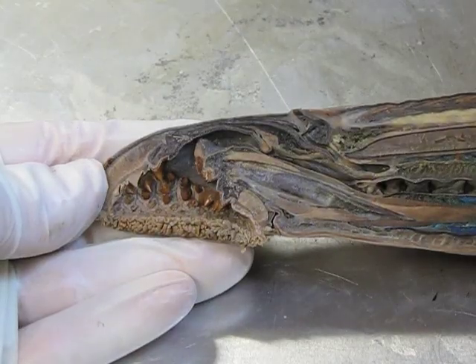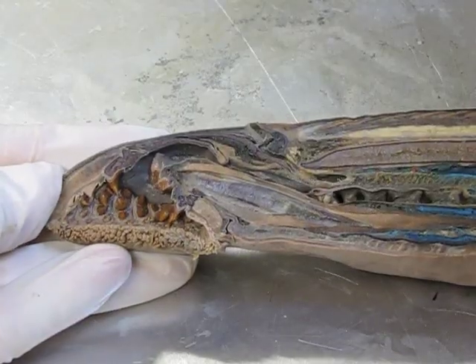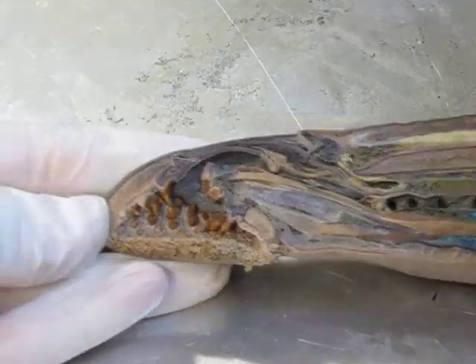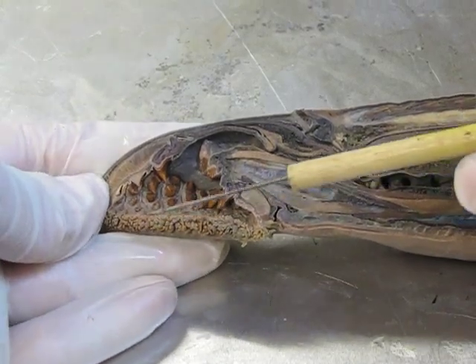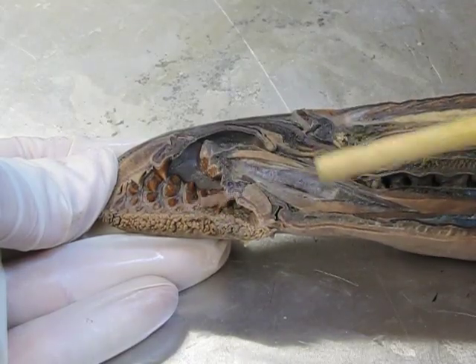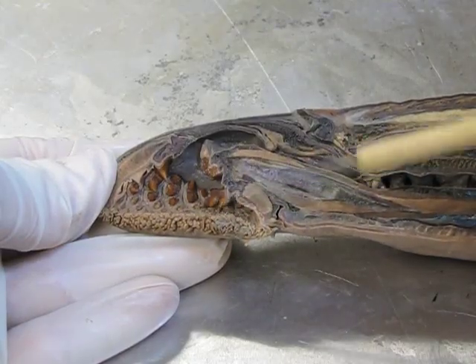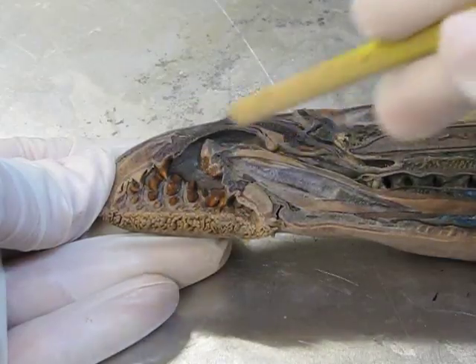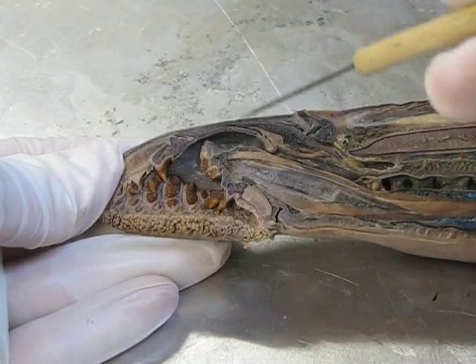Here's our lamprey cut in half. The dorsal surface is up here. The animal has been injected with different colored latex to make certain structures visible — that's obviously not how the animal looks in life. Starting at the mouth end: the opening is lined with sensory papillae, the little protuberances it uses to feel. On the inside of the mouth are wicked, spiny, hard, pointy teeth, which are used to scrape off skin and scales to access the body fluids of the host animal.